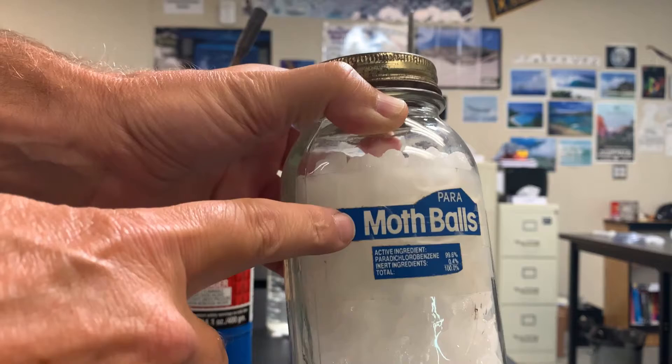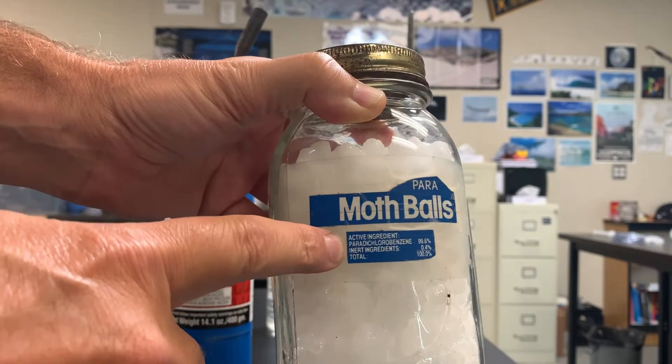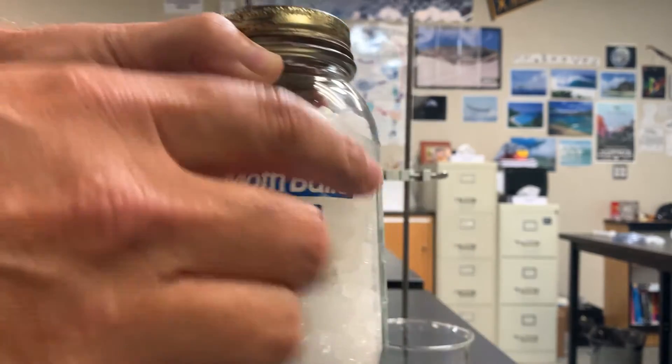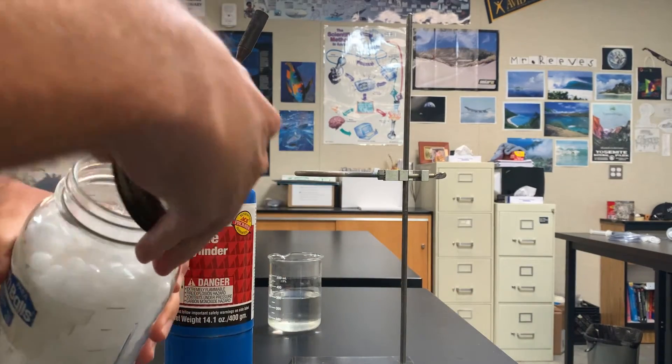So the chemical in this mothball is called paradichlorobenzene. Try saying that three times. Paradichlorobenzene. And right now it's a solid. I'm going to pour some out into this beaker.